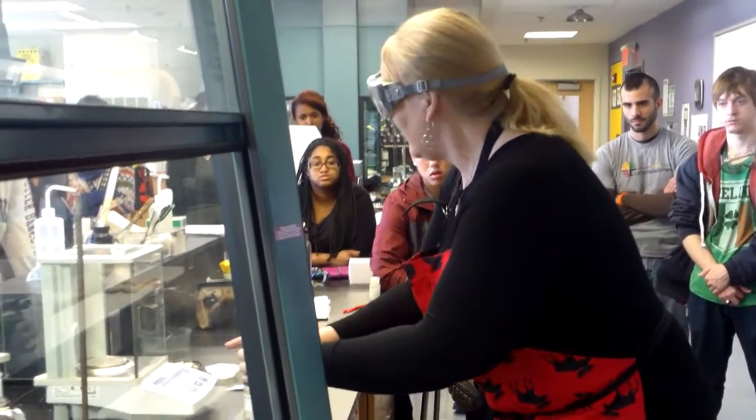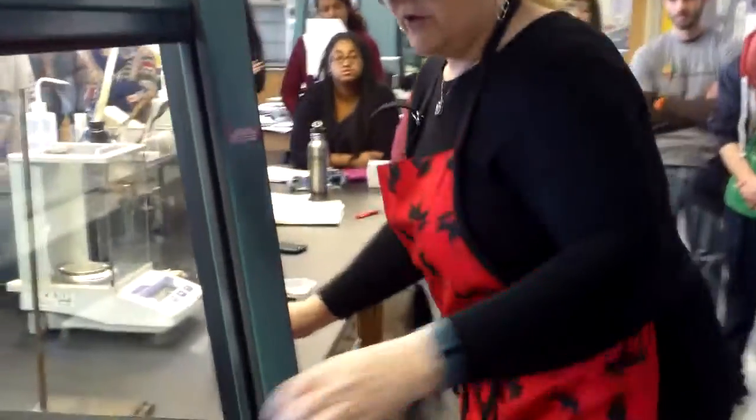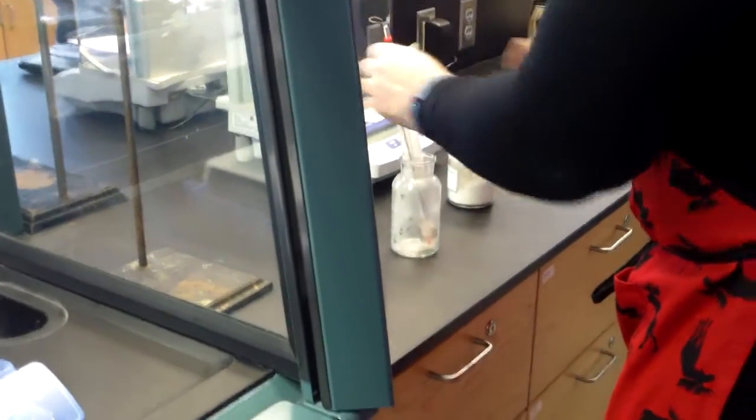You'll take your naphthalene out, and you will set it into one of these guys. This is a gas bottle. You will get your thermometer and a stirrer. And it really looks just as silly as that.